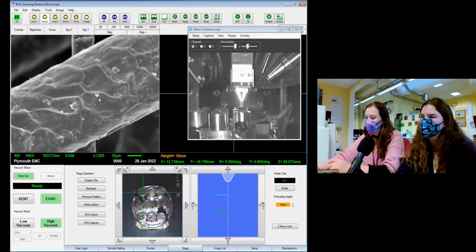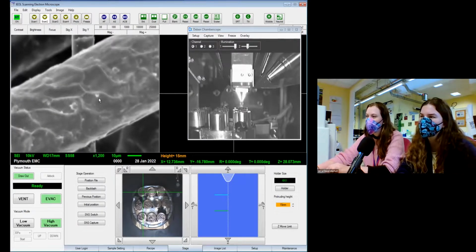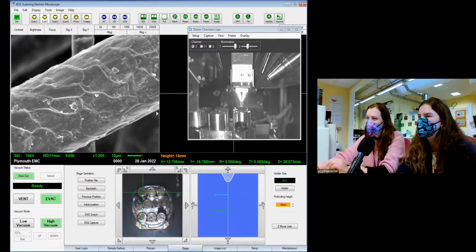So you can see what I'm doing here is I'm just bringing it in and out of focus to try and make sure we get it at that nice sweet point where it's a good crisp image. In my defense, I don't have my glasses on, so what I think is in focus may be slightly out. Looks good to me. That's not bad. Yeah, it looks good. Got some nice texture on it. Just a nice close-up of some sheep.